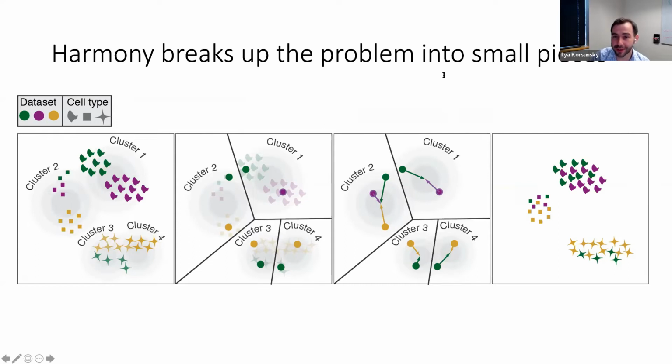Okay, so Amrit asks, just to clarify, Harmony corrects for local batches instead of global correction. Is it possible to do both? Yeah, it's a very good question. It's something I want to include in the next model. Again, it is just regression, right? We can include a global intercept and an intercept for every cluster, basically, and that's definitely what I want to do. In practice, my gut feeling is that it's not going to change much, but it is more elegant to do it that way.